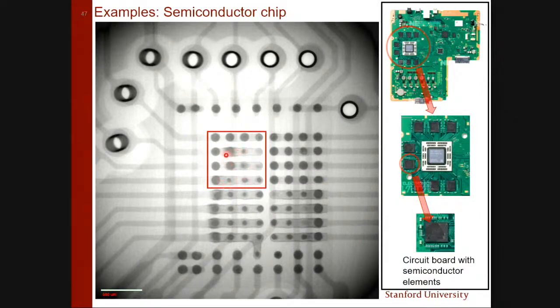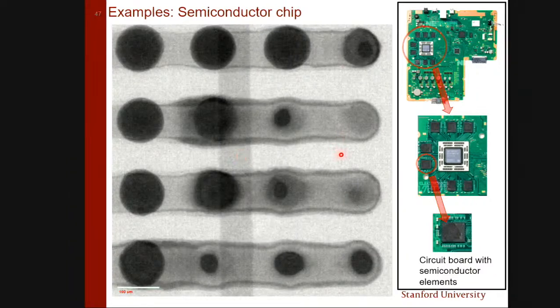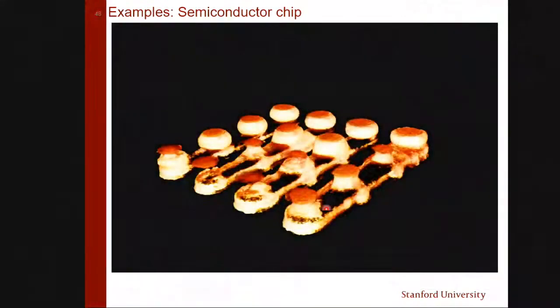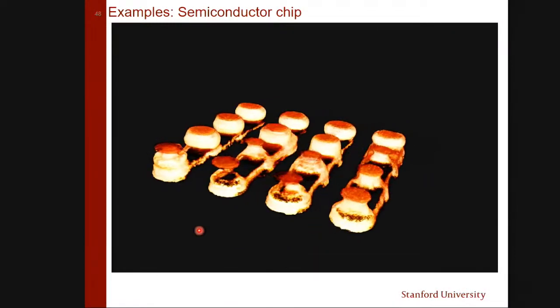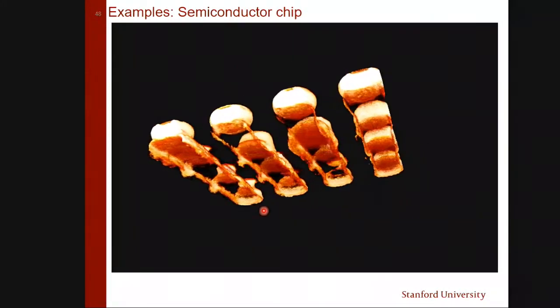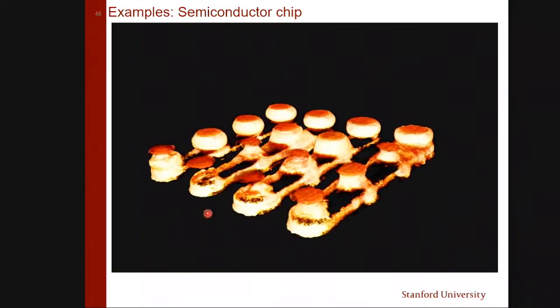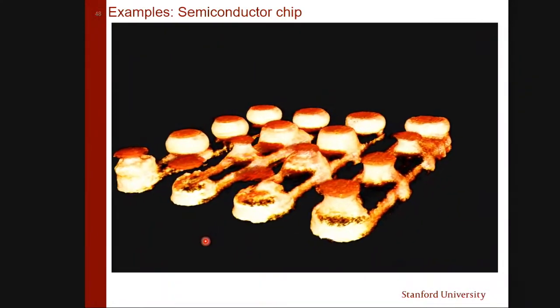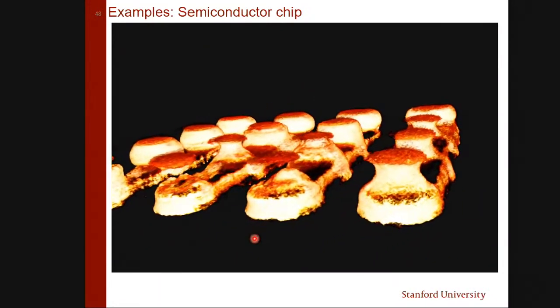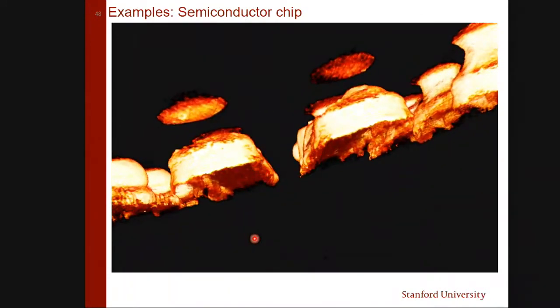They're not uniform, correct? So here, you have a zoomed-in image. And now, this is 2D. Something is happening, you don't know what. Then you do 3D, and then you will see that some contacts are good, and some, as you can see, are not actually contacts anymore. They're separated. So this particular device failed because of the contact issue here. And you can immediately solve this problem and understand what is actually happening. During the soldering process, probably there was something happening.